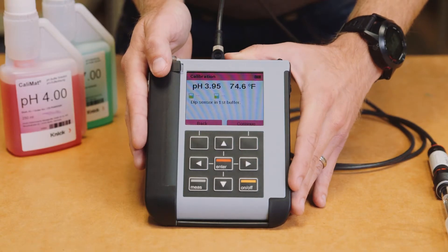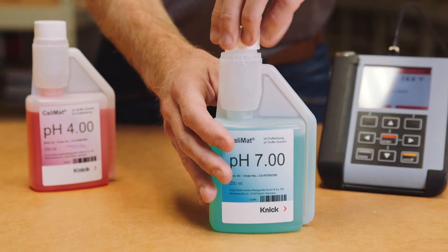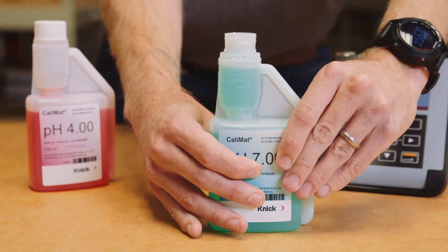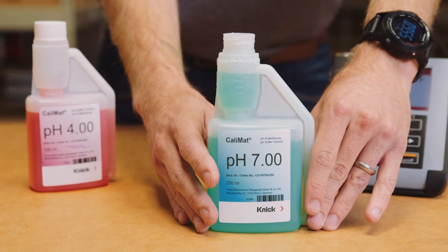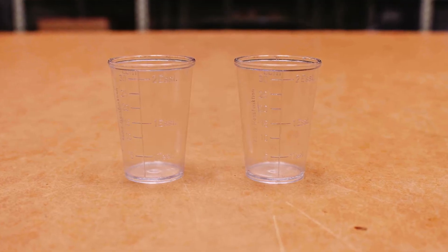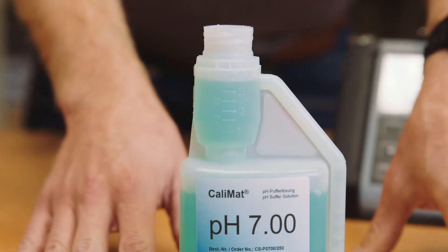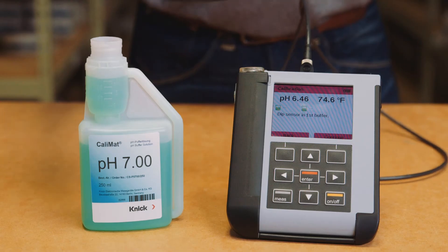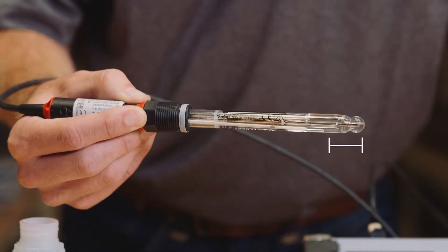Press the upper right button to start the process. The calibration process on the Portavo 907 Multi is very intuitive and straightforward — it prompts you to dip the sensor in the first buffer solution. With automatic calibration, it does not matter which buffer solution you start with. I will begin using Buffer 7. I'm using the Calimat buffers which utilize an integrated dosing cup on the top of the bottle for single dose usage. If you're not using Knick Calimat buffers, put your buffer in a separate container for accurate calibration and to prevent cross-contamination. It's recommended to use fresh buffer solution for each calibration to ensure accuracy. Dip the sensor in the first buffer solution and stir lightly. The junction on the sensor needs to be fully immersed in the buffer, covering about 1 inch of the sensor.